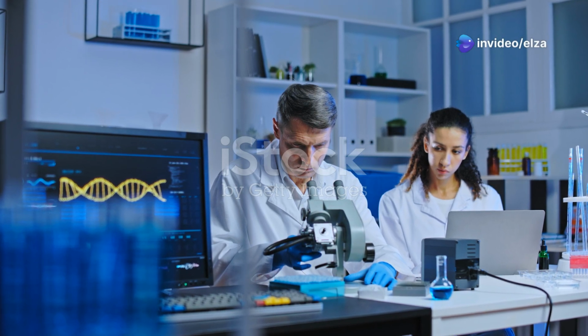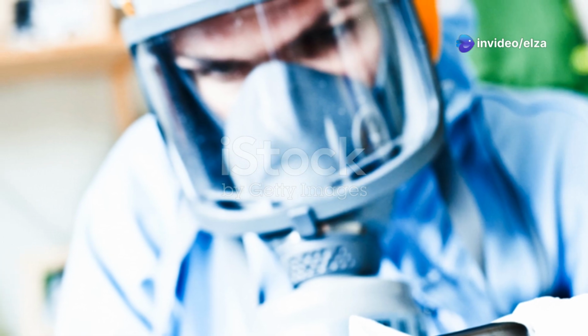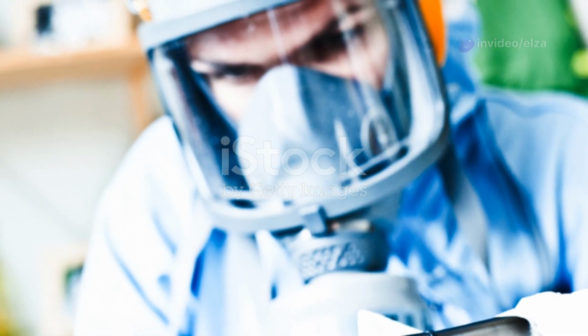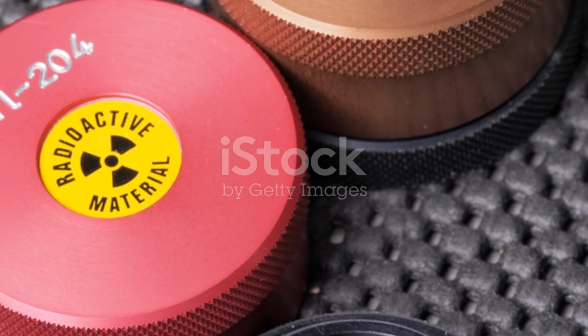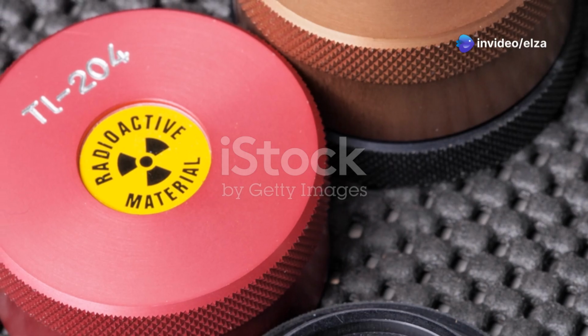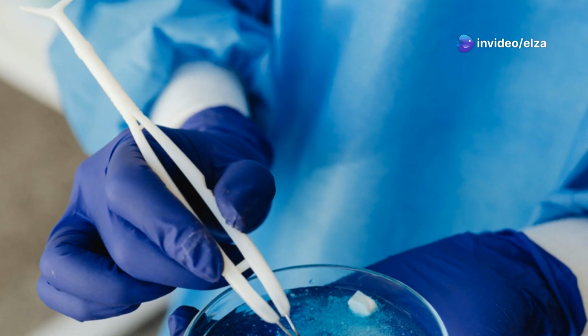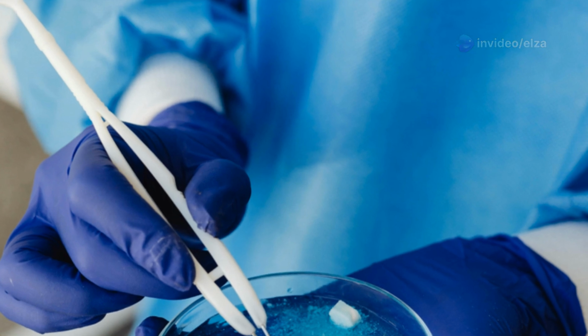Microscopic autoradiography involves several key steps. The first step is incorporating radioactive isotopes, which act as tracers. Common isotopes used include tritium, carbon-14, and phosphorus-32. Next, the biological specimen, such as a tissue section or cell culture, is prepared.